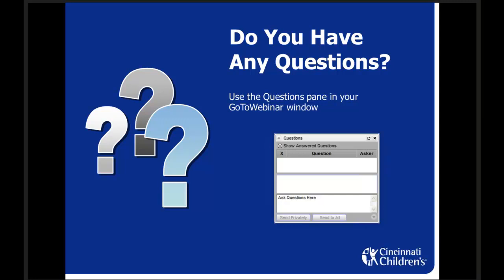Can we have another question? What reference genome did you align your data to? And have you ever encountered a situation in which the reference genome is incorrect? So in this particular data set today, I kind of cheated. This is actually a little bit older data set. It was originally built based on build 36, and that's what the BAM files that I was using.